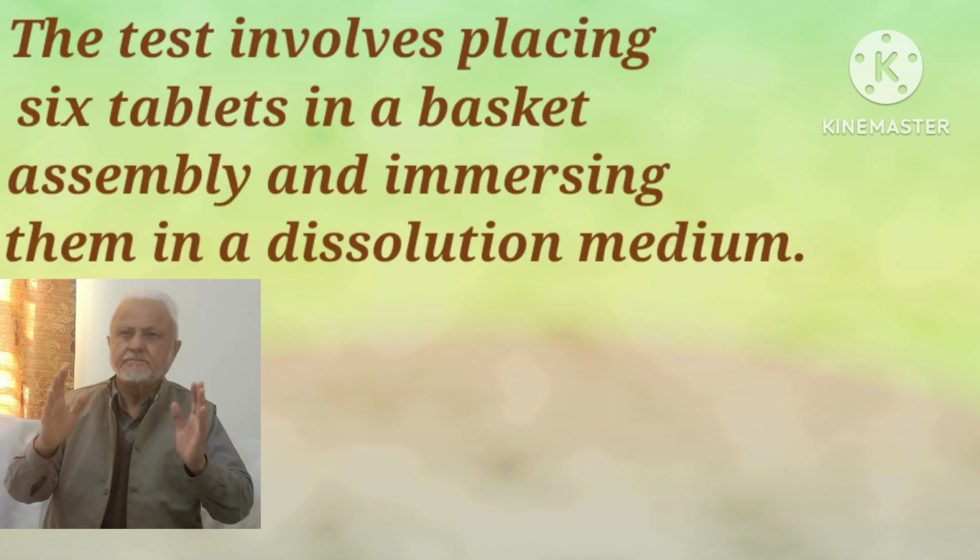The test involves placing 6 tablets in a basket assembly and immersing them in a dissolution medium.